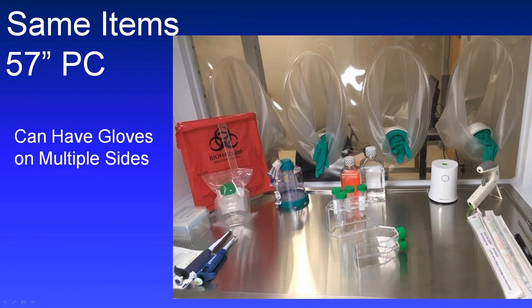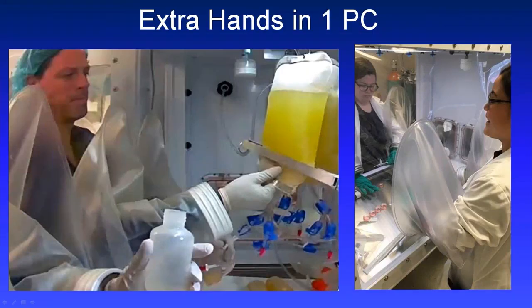You may want to rethink your layout in your processing items in moving into the Xvivo system, in that, especially if you have people working on both sides, you're going to need to rearrange items a little differently.